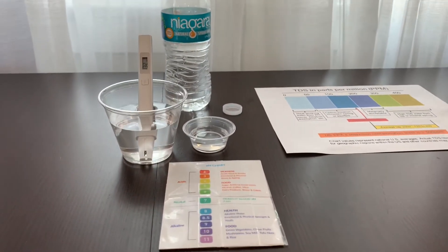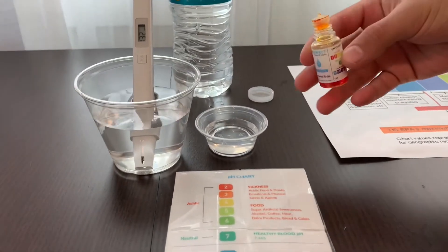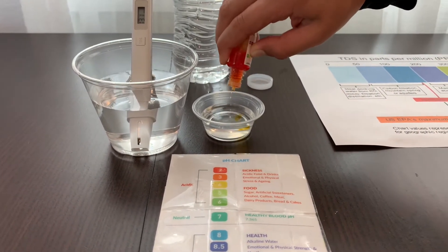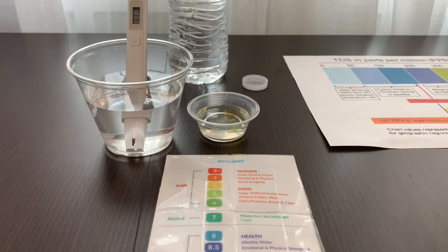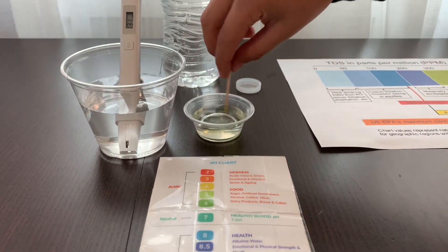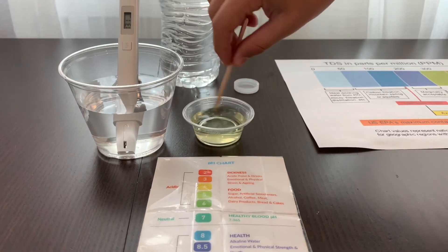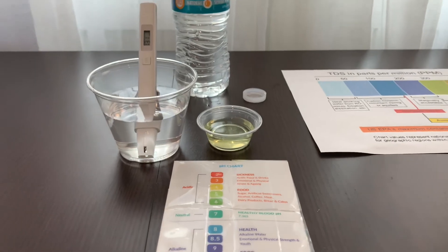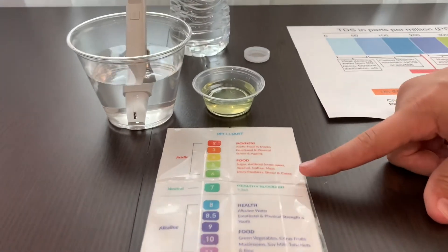Now, let's test the pH level. Do two to three drops. Let's stir it a little for a better result. I give this a six. This is acidic water.